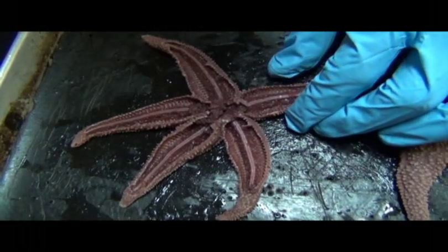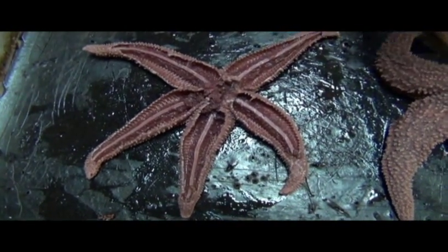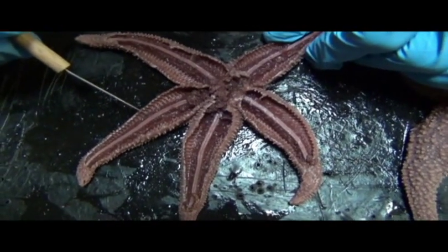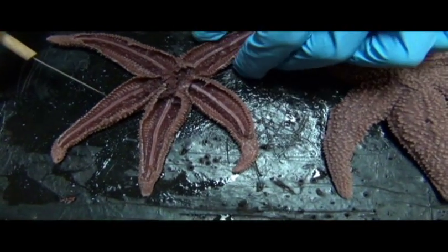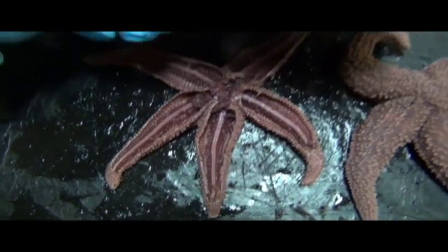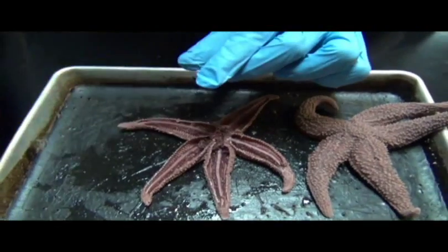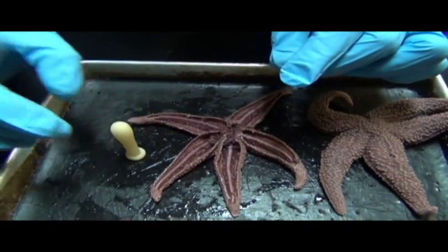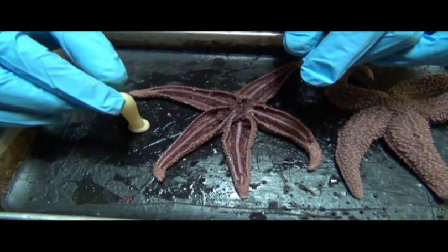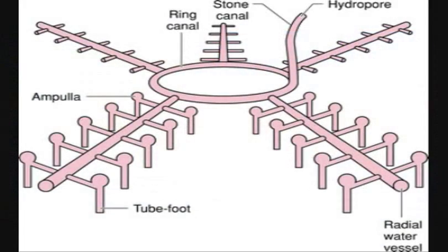Now, you can't really see it in this specimen, but imagine if we were to zoom in, let's say just on one tube foot, maybe this one. What you would basically see is something that looks like this. Okay, and so this is a squeeze bulb, a rubber bulb for a pipette, but this thing really illustrates the overall structure of one of these tube feet.